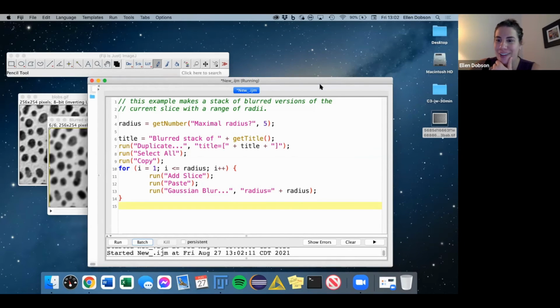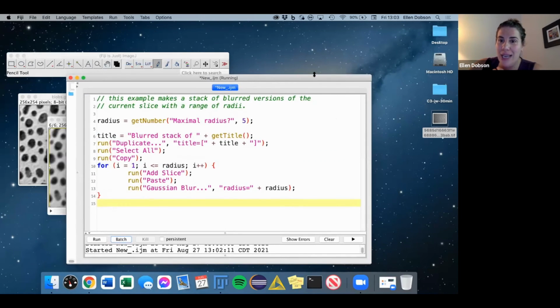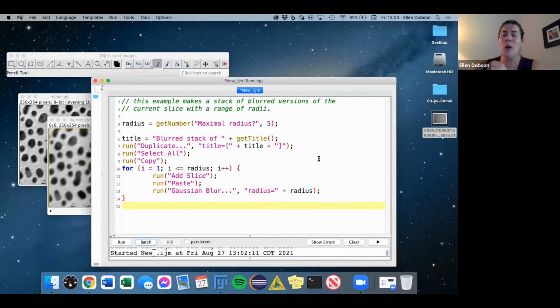Okay, I'll just tell you. Or maybe I'm losing people, but it's right here. A lot of the things with variables is that you want to make sure they're named so that the name of the variable makes sense. So in this case, this radius should actually be the maximum radius that we're getting back from the user. And i is what's incrementing. So that's what should actually be here when we're increasing the Gaussian. So each time we go through, this radius actually should be i.